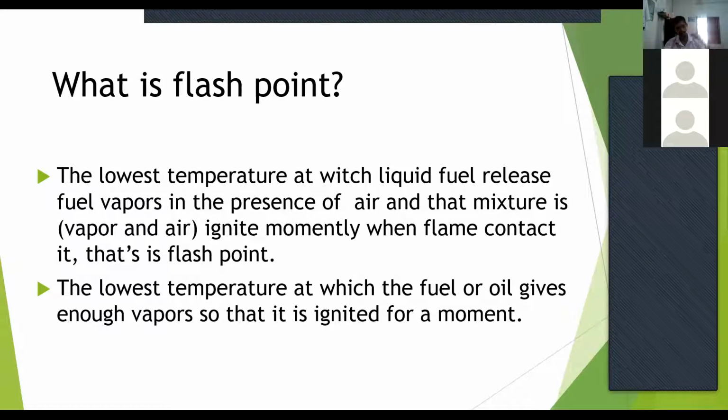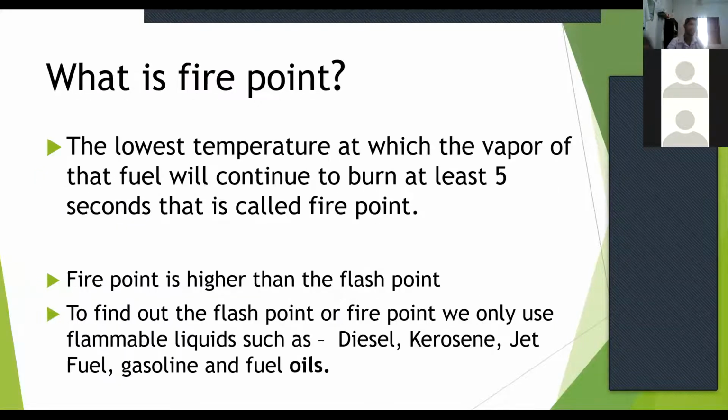The fire point is always higher than the flash point. The fire point is the lowest temperature at which the vapor of the fuel will continue to burn. Here, when we introduce a flame to the fuel vapor and air, it will not only ignite, it will continue to burn.